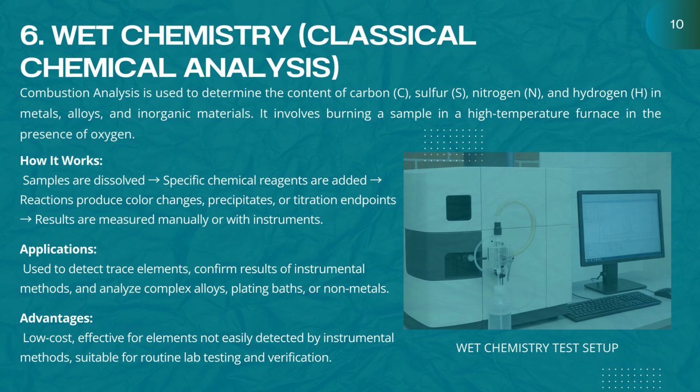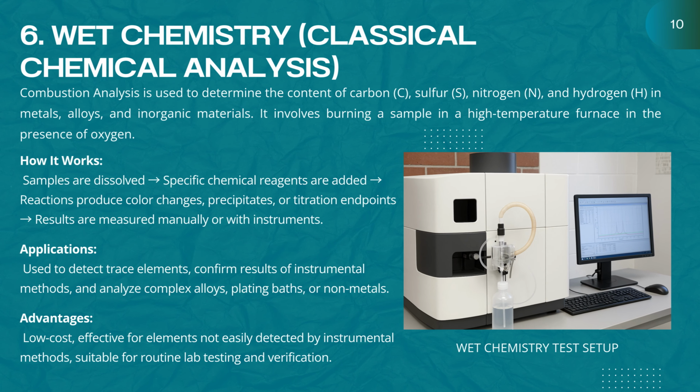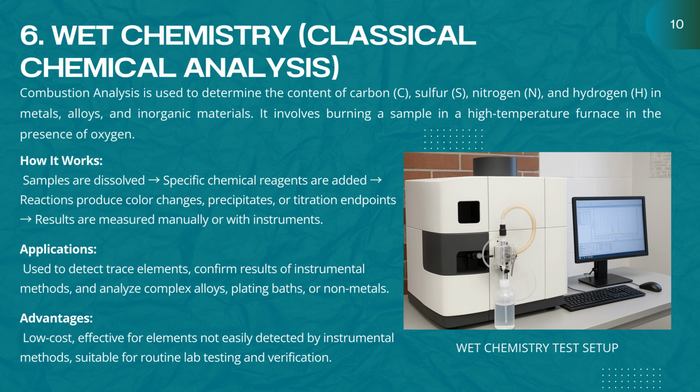Now let's move on to wet chemistry, also known as classical chemical analysis. Unlike combustion methods, here we dissolve the sample and then add specific chemical reagents. These reactions can lead to colour changes, precipitates, or titration endpoints, which we then measure, either manually or with instruments.